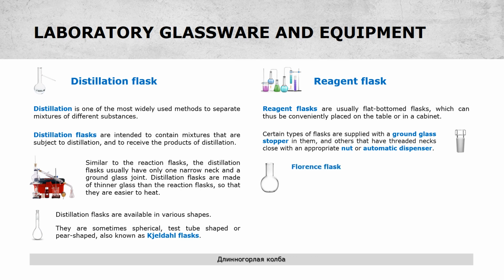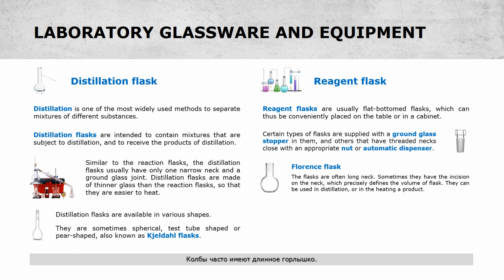Florence flask. The flasks are often long neck. Sometimes they have the incision on the neck, which precisely defines the volume of flask. They can be used in distillation, or in the heating of a product.